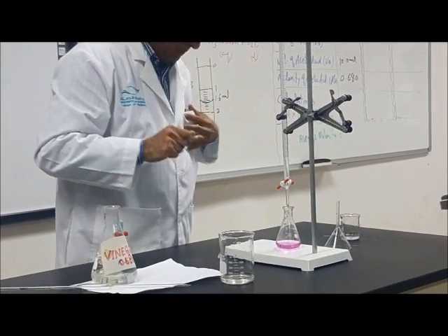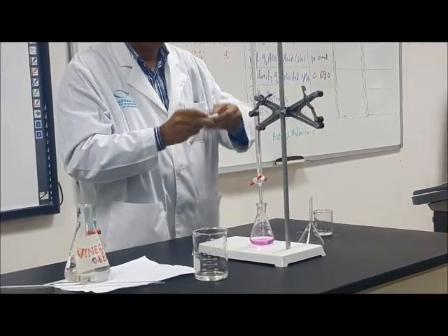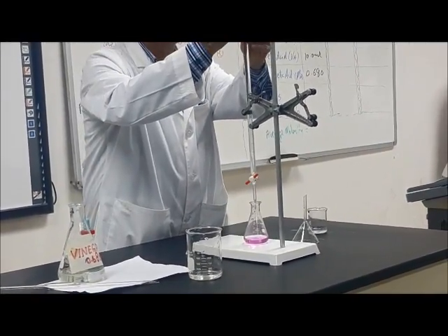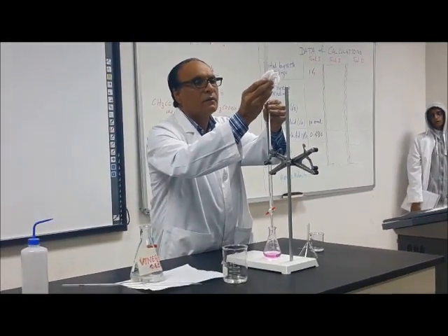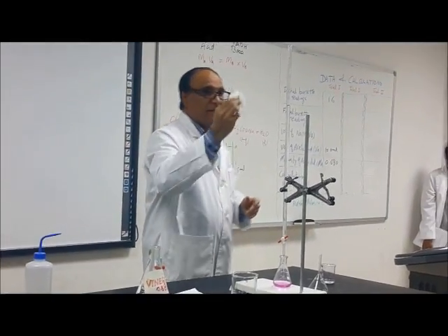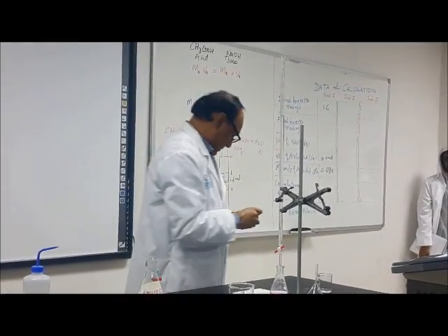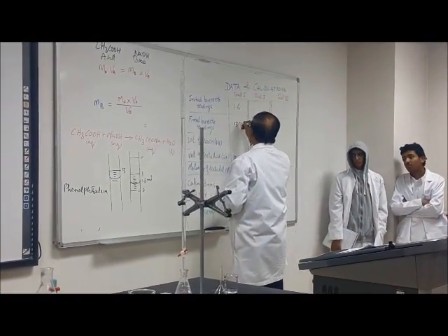And let's suppose now the reading is 13.3. When you read it, put the paper and look at it carefully. This is 13.3.